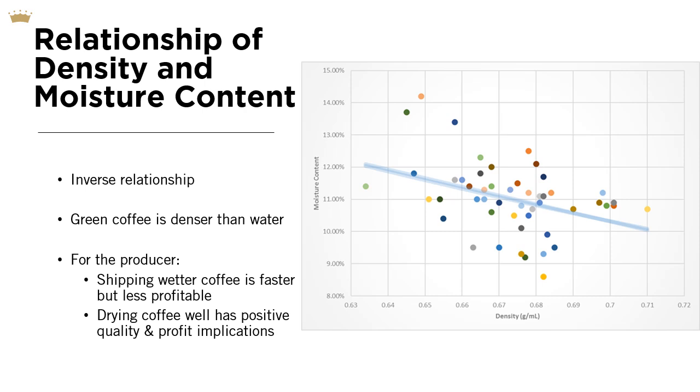To demonstrate this, I surveyed 50 recent crown jewel analyses, and a trend began to emerge. I cross-referenced the moisture content with the density measured by free settling. And as the density increases from left to right on the chart, the moisture tends to trend downward to the tune of about 1% for every 0.04 grams per milliliter.